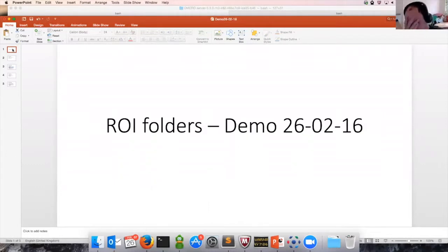So we are talking about starting work on the next breaking series. That's the next set of model changes that should hopefully be released later this year. We don't have a clear date at the moment. This is mostly the work that's been done and included in the last 2 months, both on the back end, so the model, Bio-Formats, server side, and also on the client side. And this will be demoed by Peter.